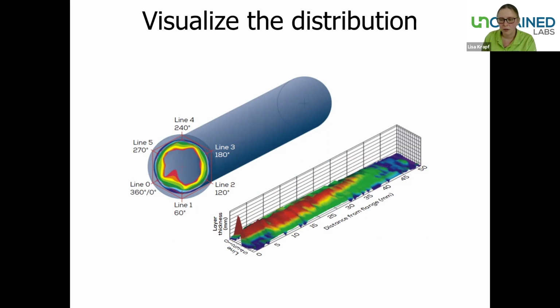And using these silicone height maps, you can see things like, is my distribution homogeneous, or do I have silicone everywhere on the whole length of the syringe, or are there areas where I didn't get silicone? And in this particular example, one thing you could probably detect here is that we see some silicone accumulation only on one or two angles we measured. This could probably be caused by storing the syringe horizontally, so that all the silicone fluid moved down to the bottom of the syringe.